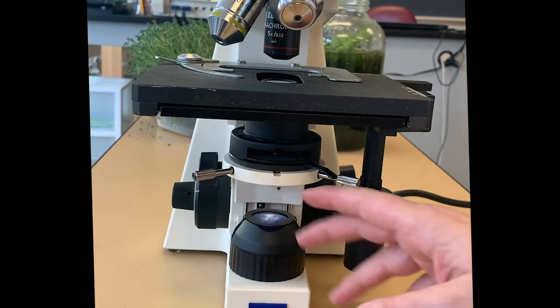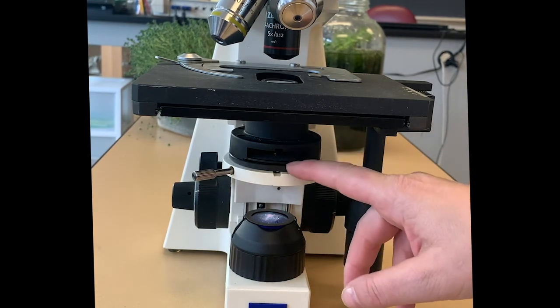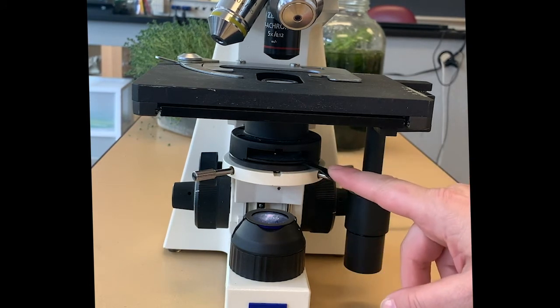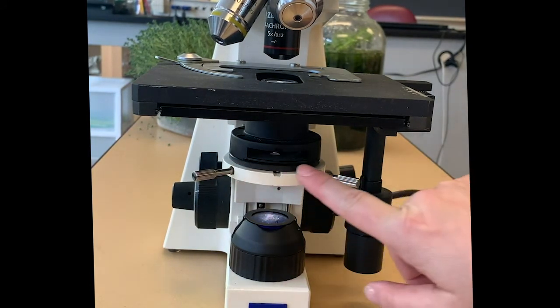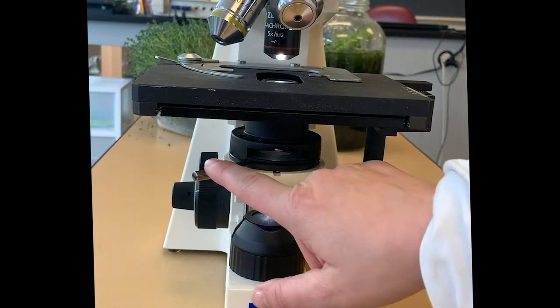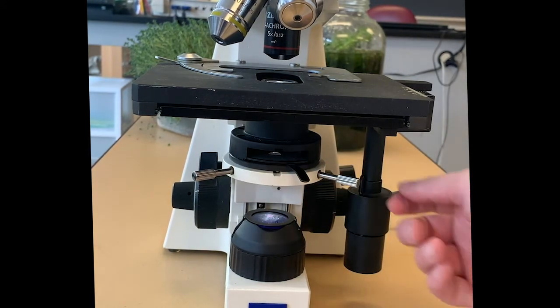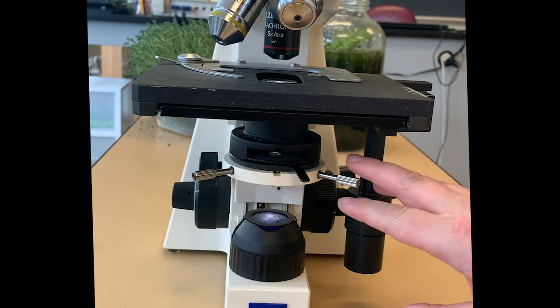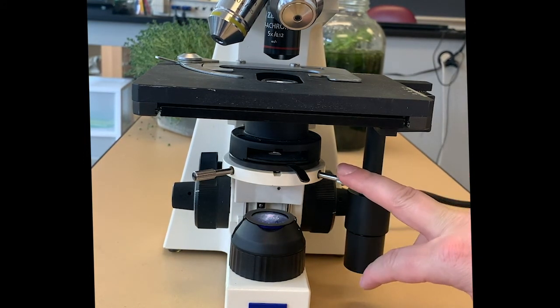Right above that is our condenser unit. That helps to focus the light through the specimen. We also have a lever for the iris diaphragm right here and that will also help with focusing the light. We have these little screws here too that will help to center the light. When we do Kohler illumination, we'll come back to these parts.